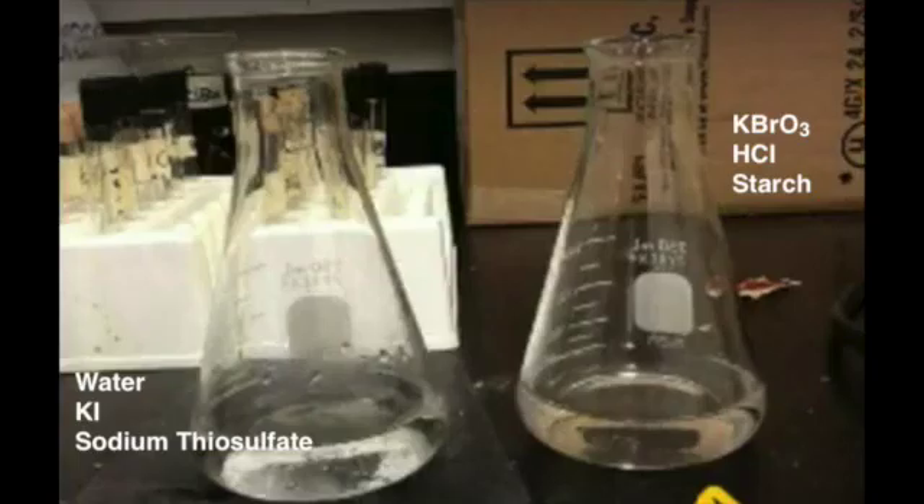Once you have the reagents on your bench, you will do the following steps for each trial you perform. First, you will prepare two flasks. In the first flask, called Flask 1 in your lab procedure, you will mix water, potassium iodide, and sodium thiosulfate.